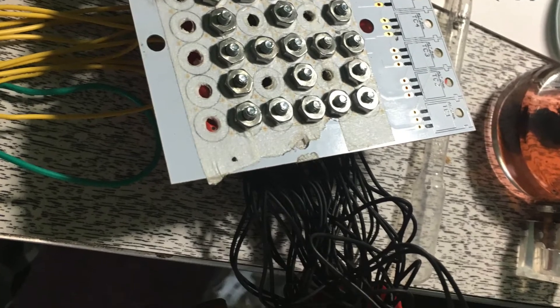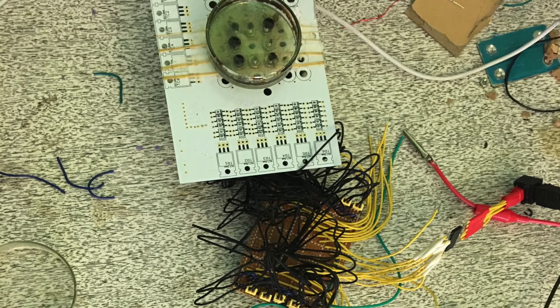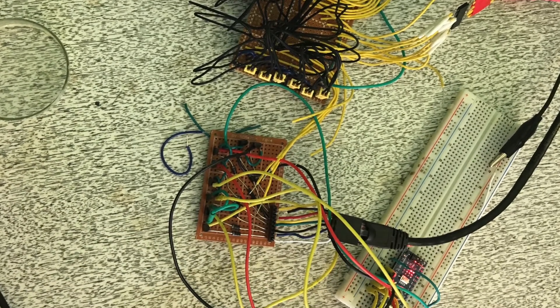I ended up switching up my design at the very end. All those wires were making it very hard to debug, so I switched to a more simple concept for this tutorial.